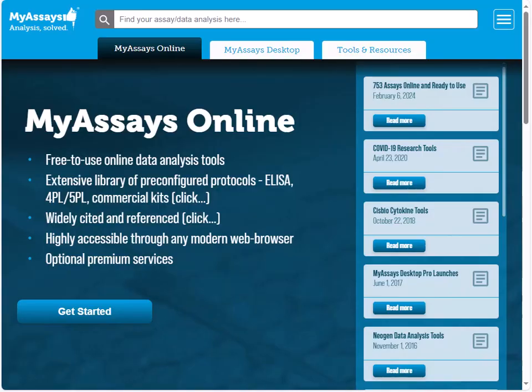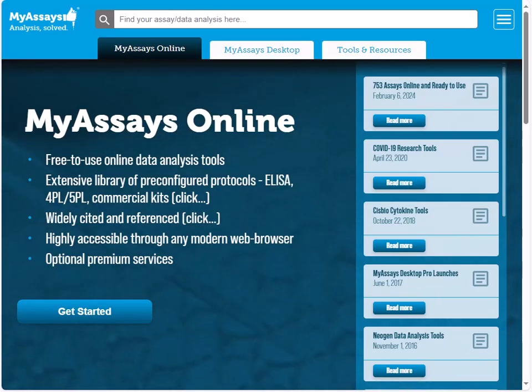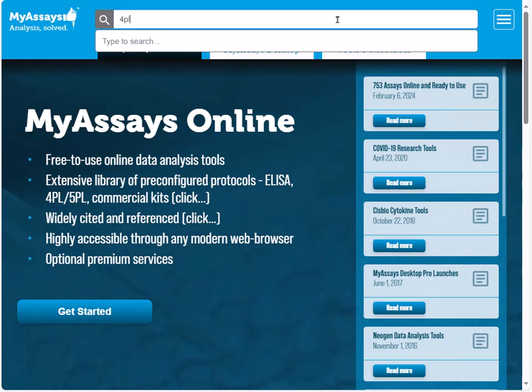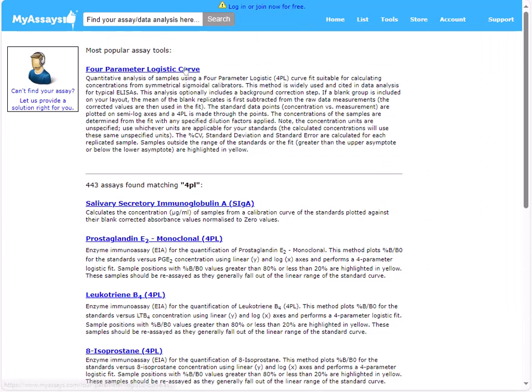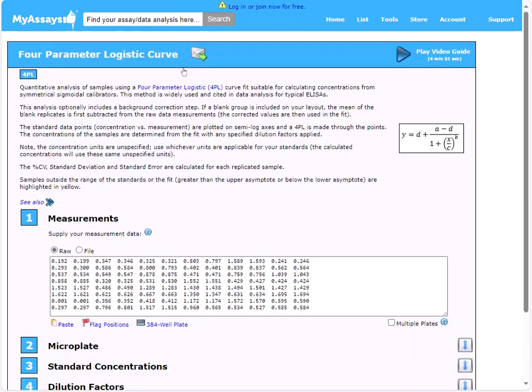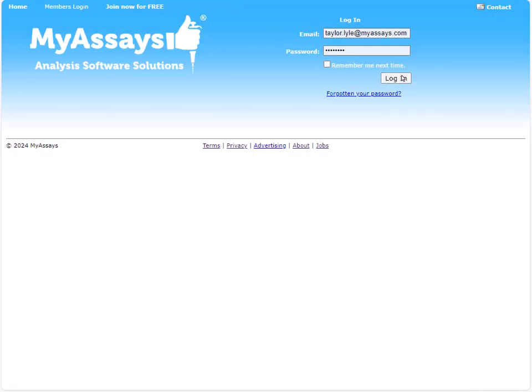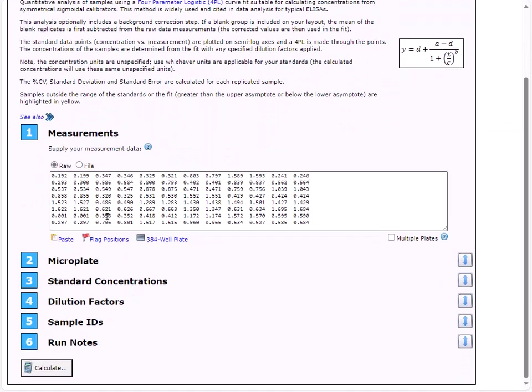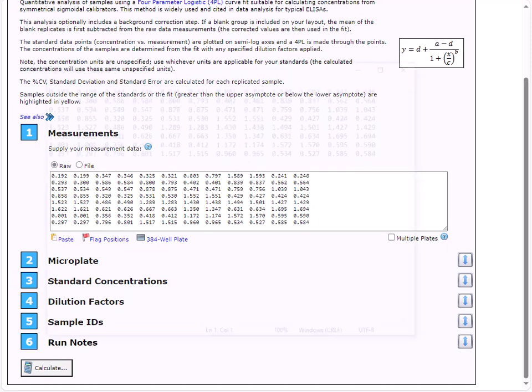I'll navigate to MyAssays.com and identify the analysis protocol I'd like to use. For this example, I'll use the four-parameter logistic curve. I'll log in to my free online account and here we can move through these tabs to quickly and easily customize the data analysis. First, I'll copy and paste in my measurement data.